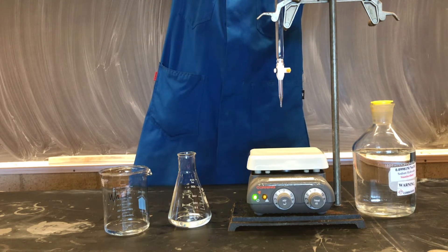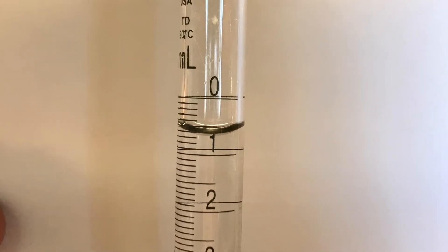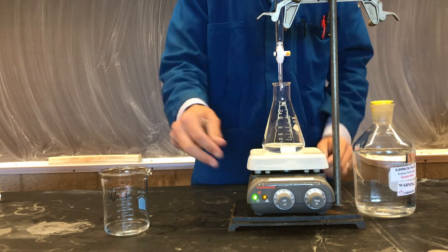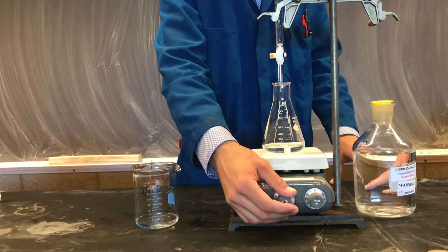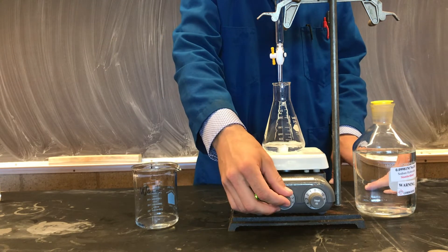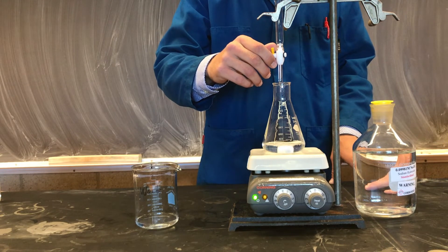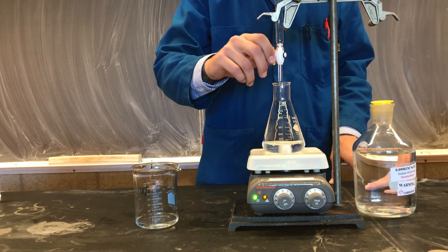It is essential in a titration to record the starting volume in the burette accurately. To begin our titration, we can put our reaction flask under our burette and turn on our stirrer on our hot plate. As we begin to dispense our titrant, we can move quickly at first, dispensing large amounts. We'll keep a sharp eye on our reaction flask.